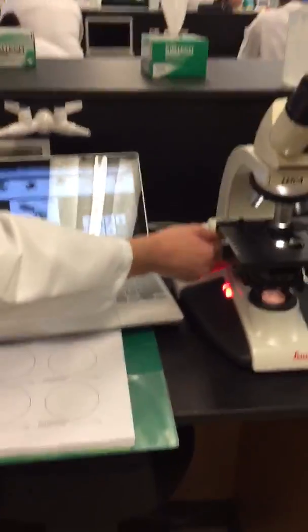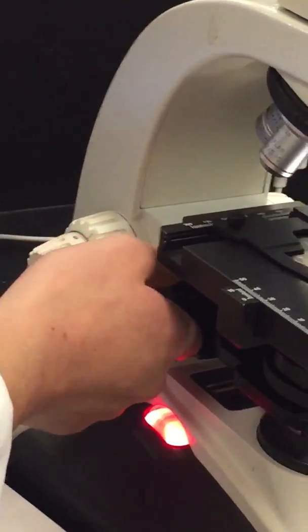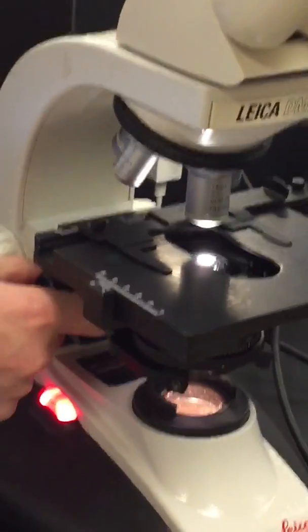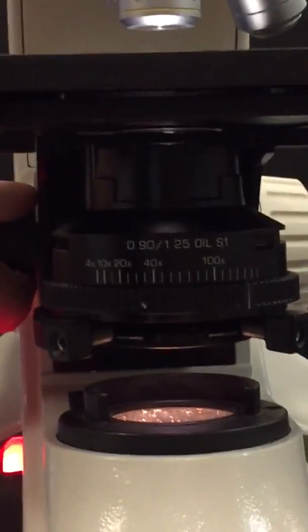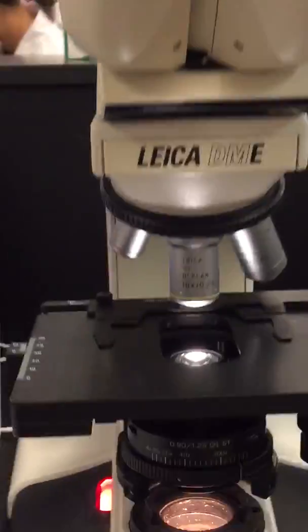This fine adjustment knob right here adjusts the bottom lens so that you'll be able to see your samples either up closer or much further, and it helps you focus in when you look through your ocular lenses so that you'll have a clearer vision of how your samples look like.